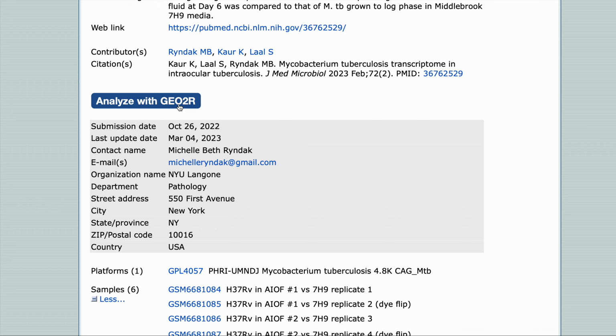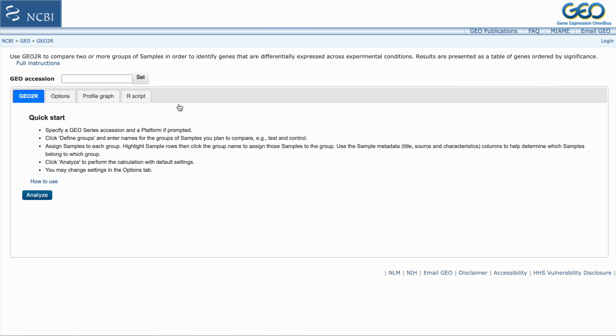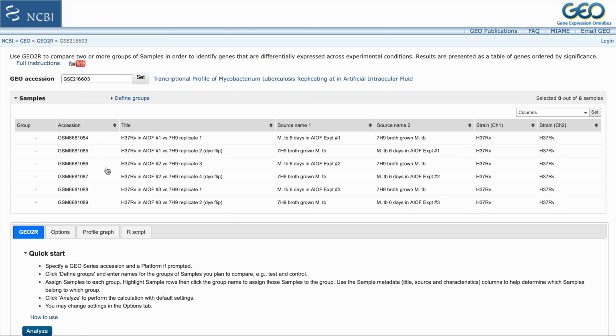Okay, but many of them will be finding this particular tool. So we are talking about this particular tool only. So we'll go by this. Otherwise, you can always do the analysis by taking that particular raw data, downloading it from the bottom that I have shown you. Okay, so you can take that data and analyze it using any of the pipelines, or use the standard pipelines, using tools like the Galaxy Server, or R or Python. Also you can utilize the language you prefer for your data analysis.